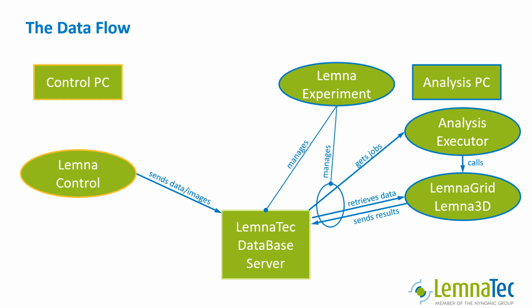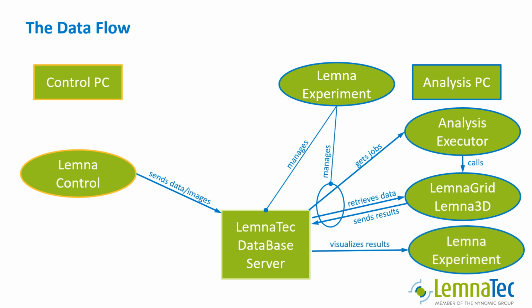At the end, we have again Lemna Experiment. In Lemna Experiment, you can look at all images and all analysis results in various visualizations. And so we have it, the software architecture of the LemnaTec software environment.